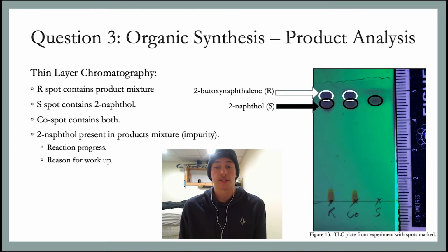So what this indicates is that the reaction did not carry out to completion, as there was still reactant left over. And this is also a good indicator of why we do the workup, because there was leftover 2-naphthol mixing with the products. So the workup is to isolate the product from that leftover reactant.